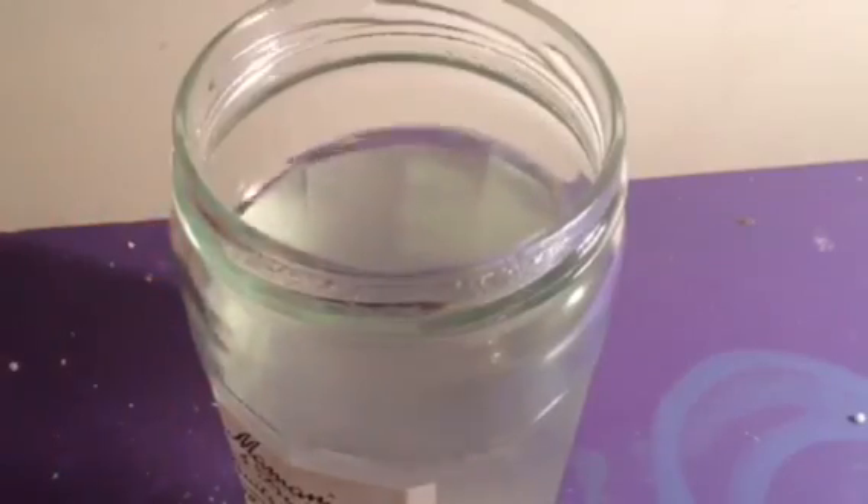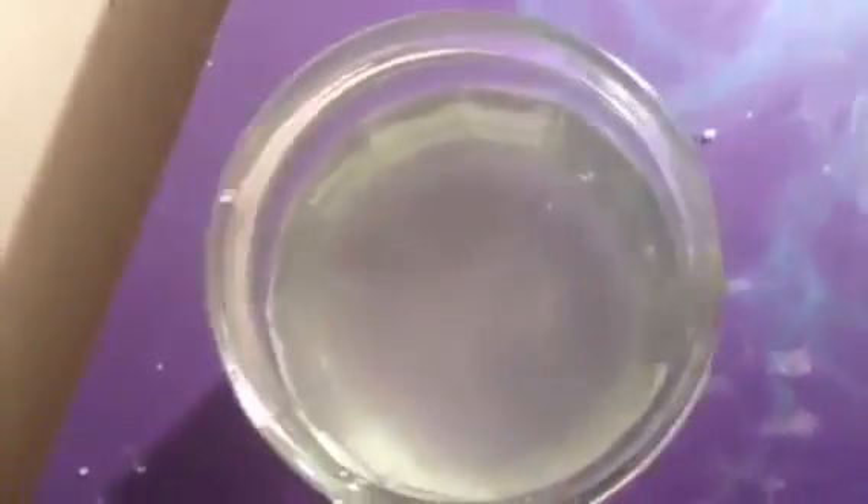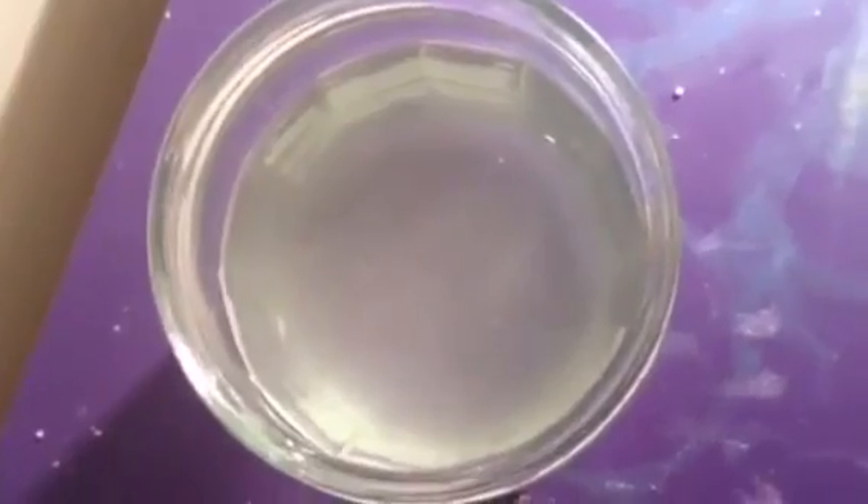Anyway, hope you like this video. This is what it looks like here on the inside — the liquid is pretty blurry. You can smell it. There are some bubbles. This is what it looks like on the side — it's like a silverish liquid.